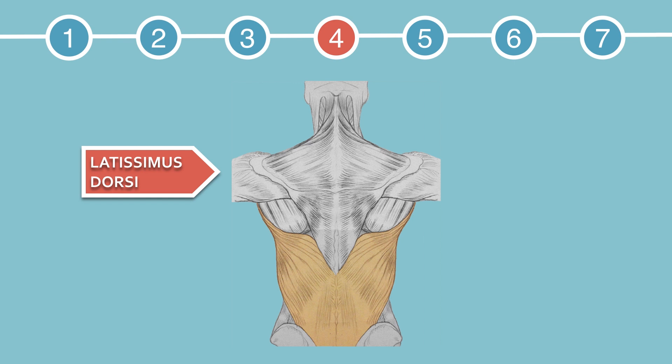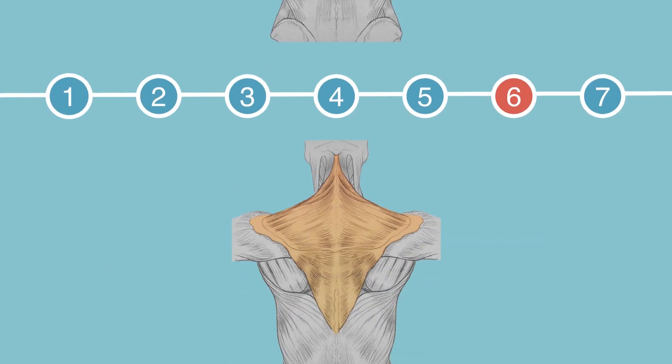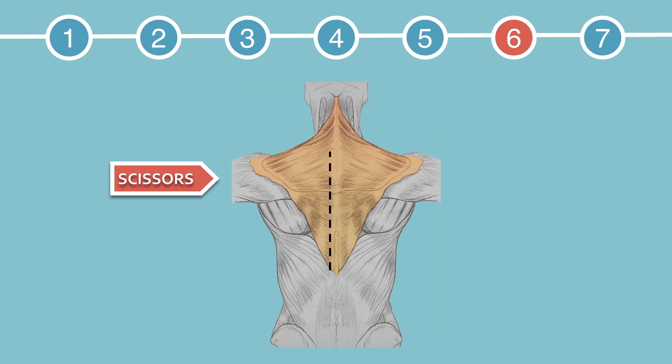On to step five. This is another tricky step. Using the back of the scalpel, or your hand, try to separate the lateral border of the trapezius from the underlying muscle — literally just try to stick your hand underneath the muscle. One thing to be mindful of is that there is a neurovascular bundle underneath the trapezius, so you don't want to be too aggressive so that you don't damage it. Now use scissors to cut along the medial border of the trapezius, but don't remove it entirely. You're doing this so that you can flip the trapezius up to see the muscles underneath.